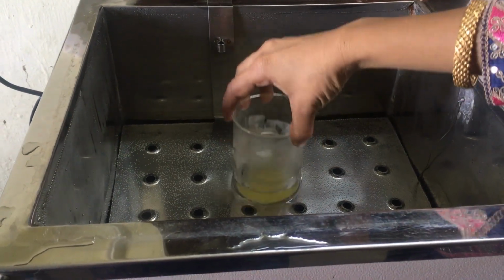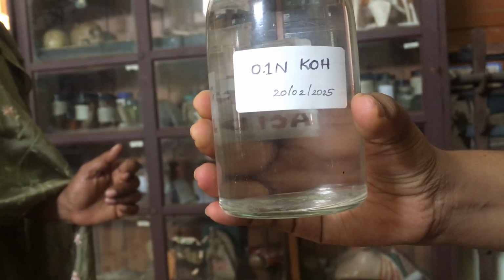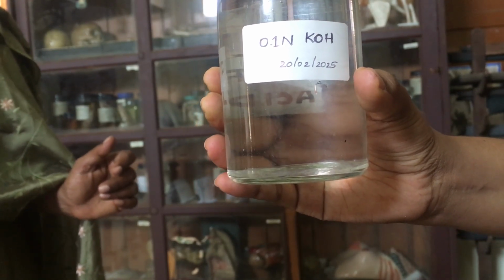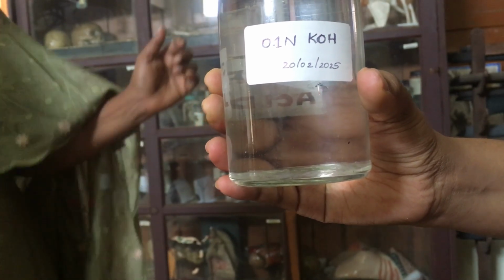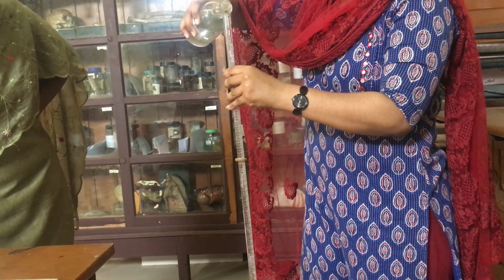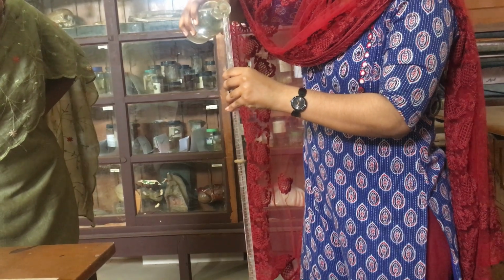Now it's completely melted. We can see it so clear here. Then next, we are going to titrate it against 0.1 normal KOH. For that, first we are rinsing a burette and filling that burette with 0.1 normal KOH.